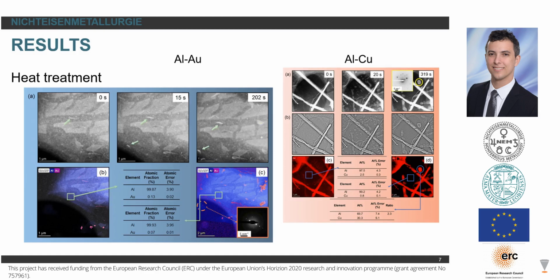It's important also to note that we need to have our sample on the hole region, because there we can do a proper selected area diffraction pattern. If you are over the silicon substrate, we can have a mixed signal from the substrate as well.